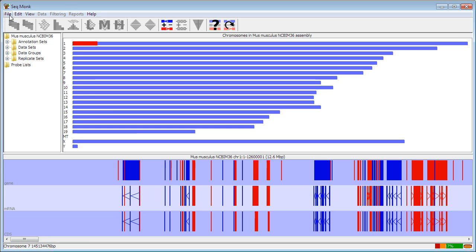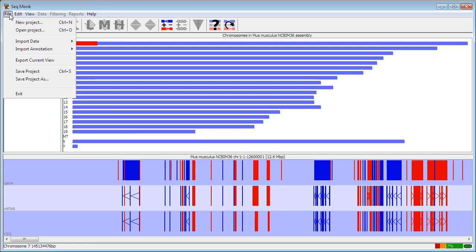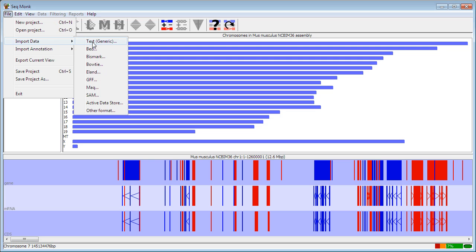To bring data into SeaMonk, you go into the File menu, Import Data, and then choose the appropriate format. You'll see that we have predefined importers for some of the more popular sequence formats, either from specific alignment programs or just generic formats.